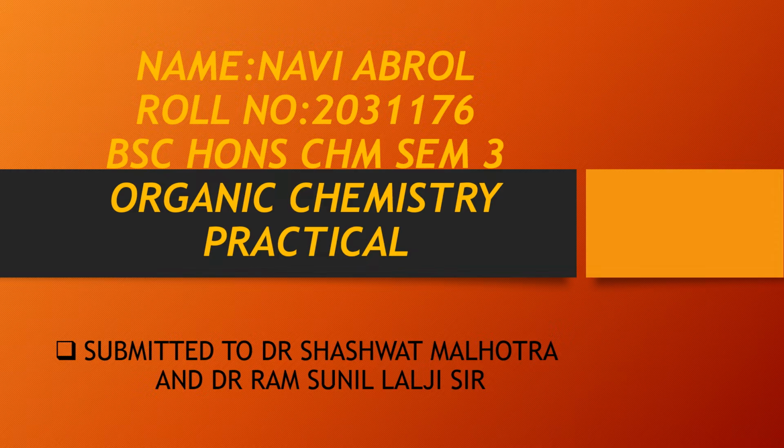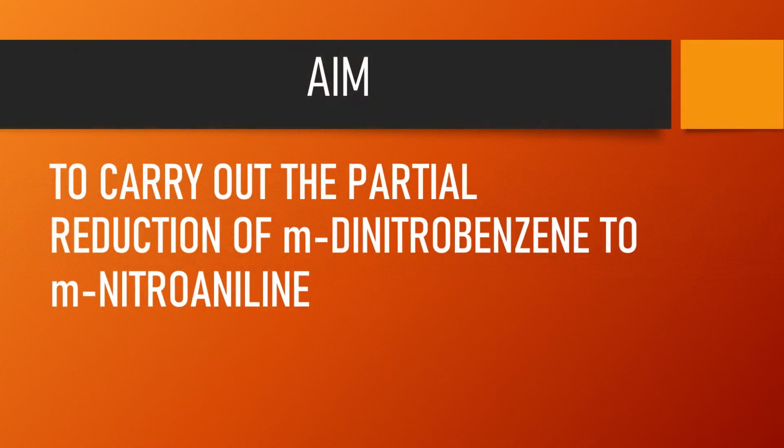Today I am going to present an organic chemistry practical which aims to carry out the partial reduction of meta-dinitrobenzene to meta-nitroaniline. So let's carry out this experiment.